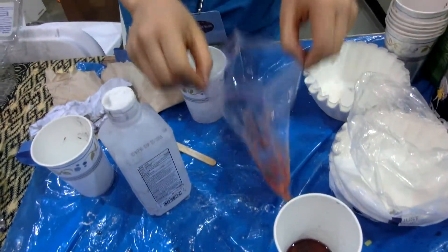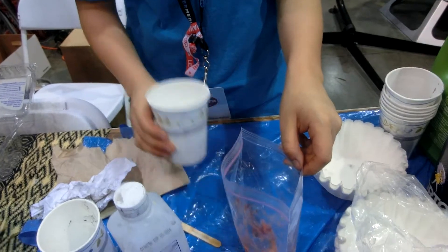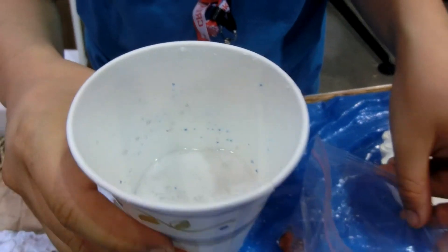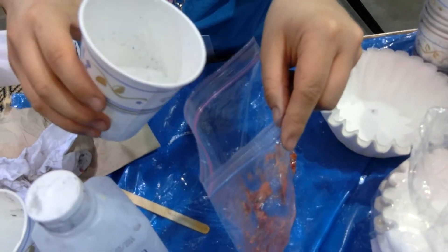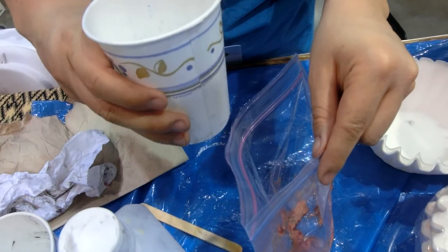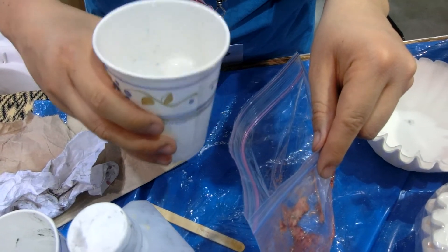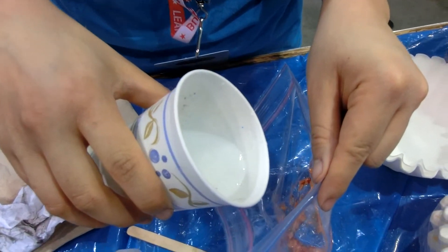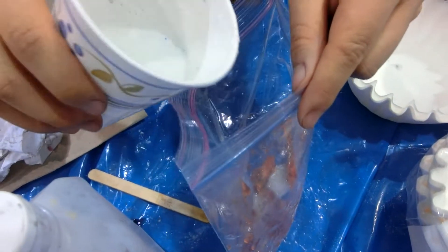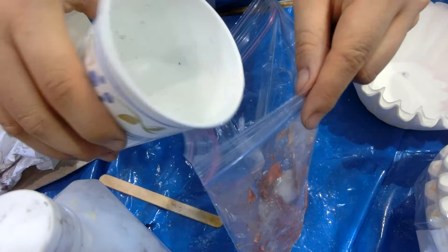So I've mashed up the strawberries and what I'm going to do is take this liquid, which is a mixture of detergent, salt, and water. The detergent should break open the cell walls. So I'm going to mix it up a little bit. The detergent should break open the cell walls and liberate the DNA from the strawberry if it works, which hopefully it will.